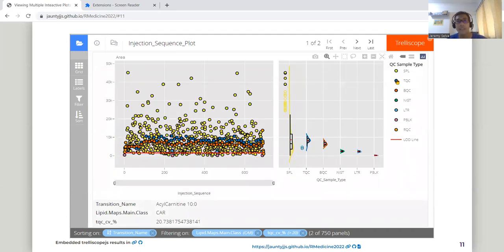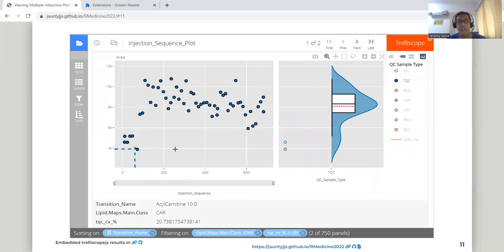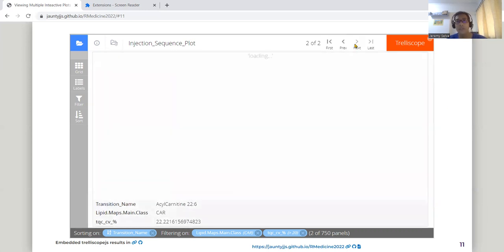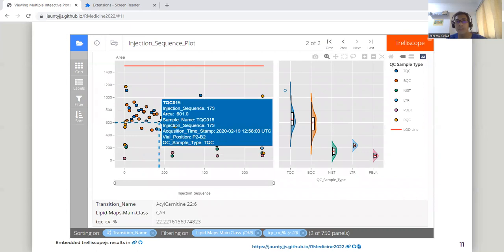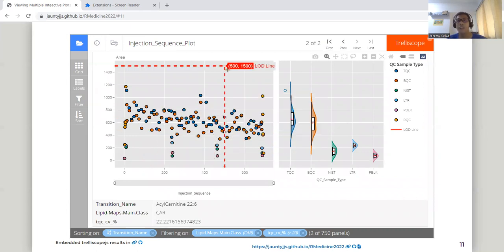Now we can see that the TQC was quite high because of something wrong with the machine in the beginning of the run. For the next transition, the variation is very high because of low signal. Because most of the points are below the limit of detection.